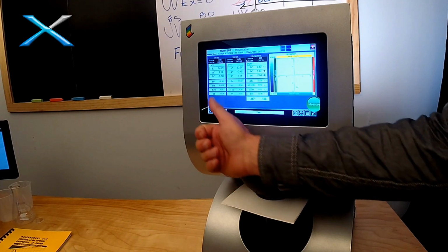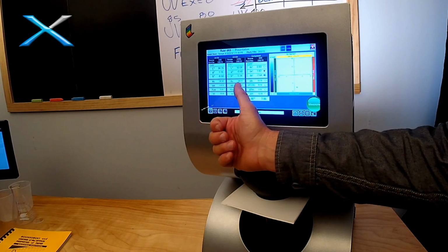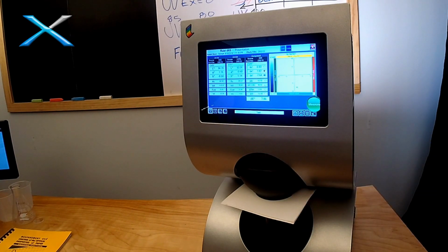Now the UV included, or D65 value, is 96.5. The UV excluded stays the same, and our component value now is 12.19, or 12.2, let's say. So now we're getting an increase in brightness of 12.2 units because of the presence of the optical brightener and the UV-rich conditions.